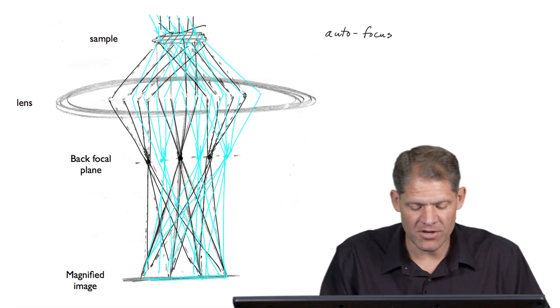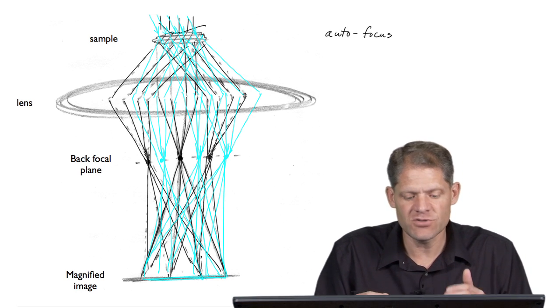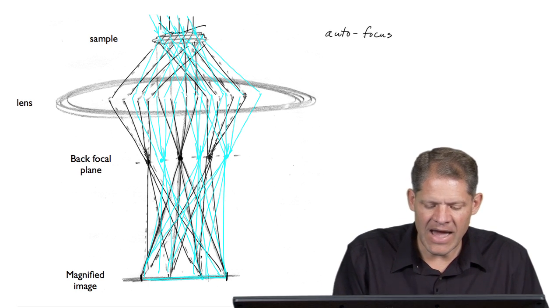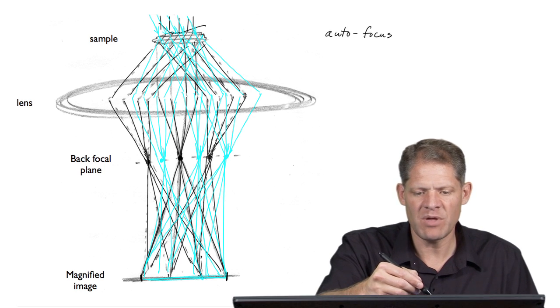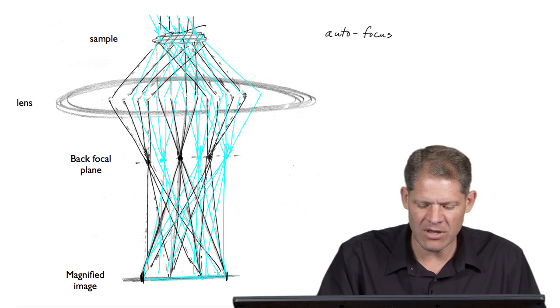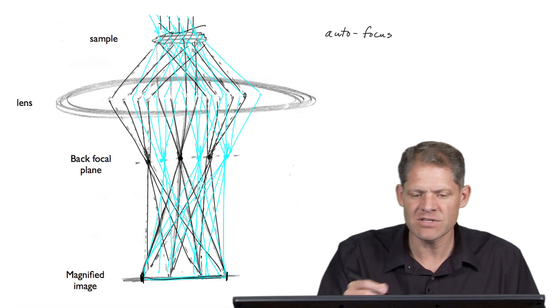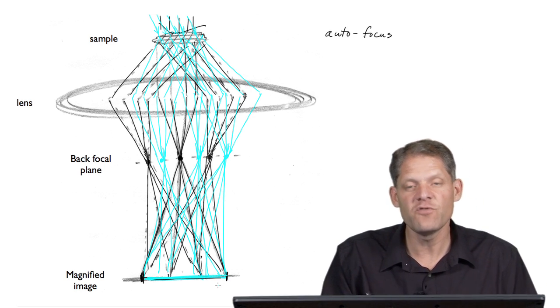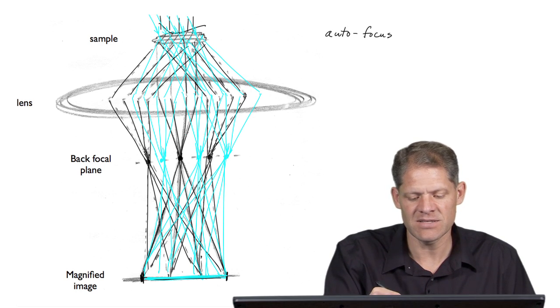Now the key thing to notice is that while the images that are formed in these two situations are in the same location at the plane where there's a focused image, in other words, if the beam is coming straight on through, you have an image formed from here to here on your detector. And likewise, even if there is a beam tilt applied, the focused image still appears from here to here on the detector. That's true for the image plane, but it's not true for any other plane in this system.